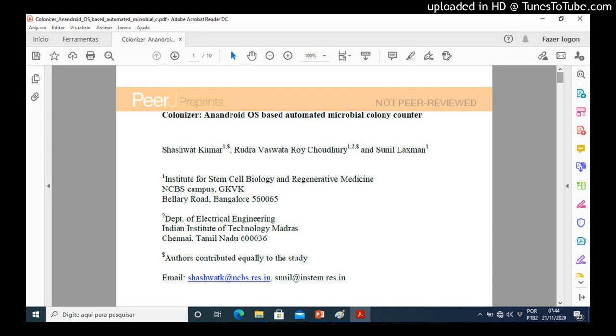Since non-uniform illumination can result in noise and artifacts leading to false counts, it is important to maintain uniformity in illumination for the image. Top-hat transform achieves this by adopting a background equalization which helps in feature extraction in an image.